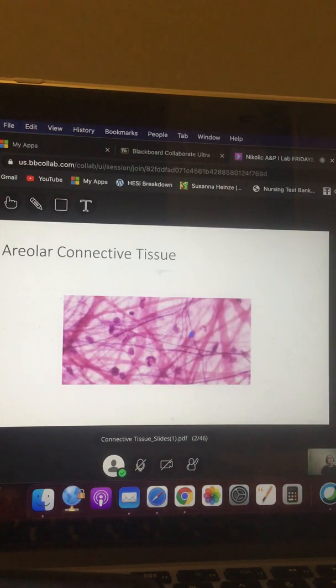Listen. I just want you guys to really pay attention to the list here. Just do what's on the list, and don't make things complicated for yourself. Awesome. So that's a fibroblast.